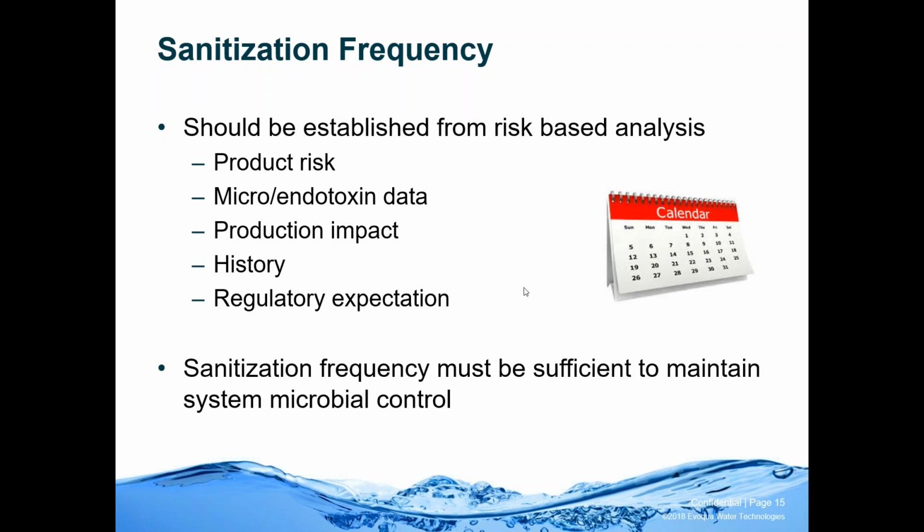How do you determine the frequency of sanitization? It should be a risk-based analysis. And most important, what is the product risk? What is the water specification for the product? What's the likelihood of failure? It's based on actual data. It can be amended based on risk basis.